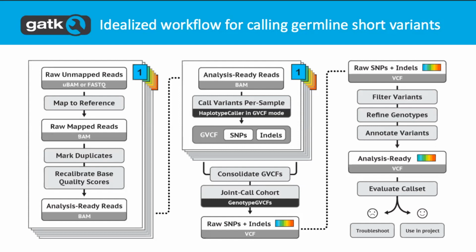Some of these algorithms use random seeds, which introduce some variability, but there's usually an option to use a specific one to enforce determinism. I'll look into it and get back to you tomorrow on the exact determinism of CNN. Usually we try to make those things as deterministic as possible. My comment on the variability was more about if you're using different reference samples, like different non-matched normals, then you will see some differences.